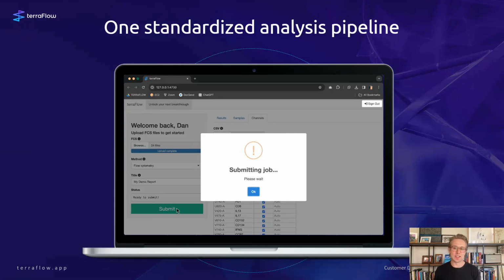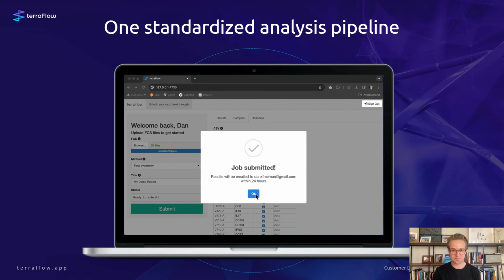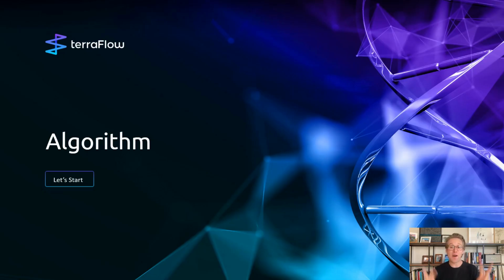And in 24 hours, you'll get an email that says, hello, Dan. Thank you for uploading your files. Click here to see your results. So while our data is processing in the cloud, I'm going to walk through some of the science that makes this type of analysis possible.